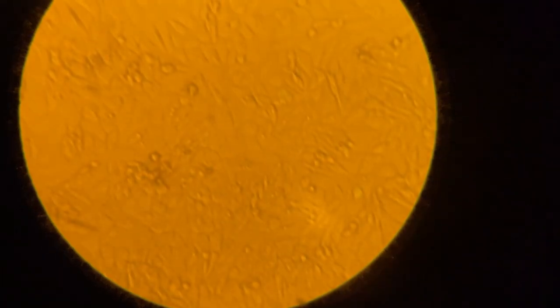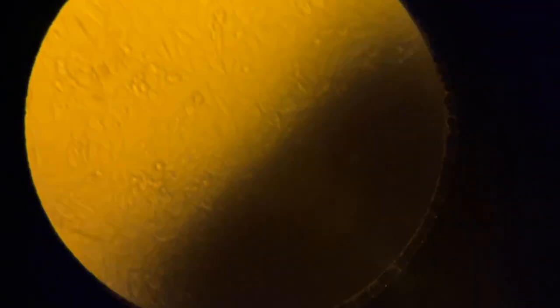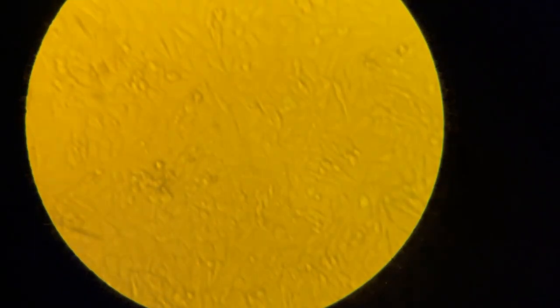Look at these cells. It's not as intense. If I put them under the fluorescent microscope, you'd actually see more detail and brighter. You can see, here's the cells. The HEK293 cells. You can see which of them are modified. It's just that simple.